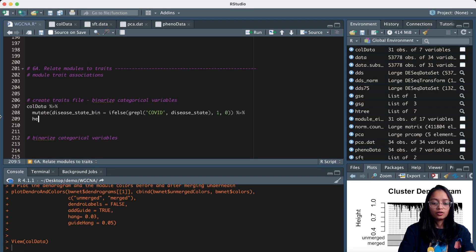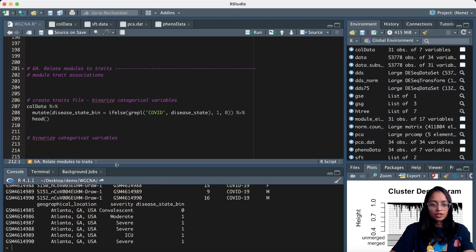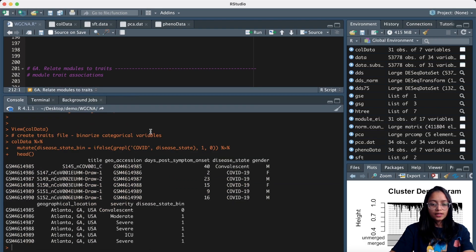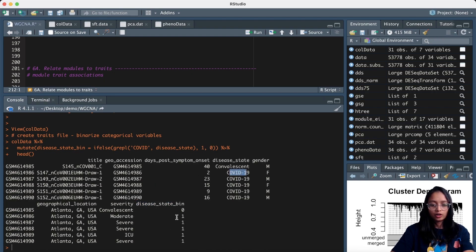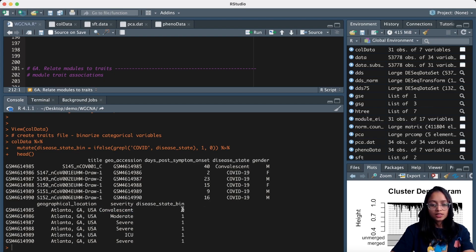Let us take a look at what that looks like. We have created a new column where all patients with COVID-19 have value one and the rest of the samples have value zero. I'm also labeling the convalescent samples as zero.